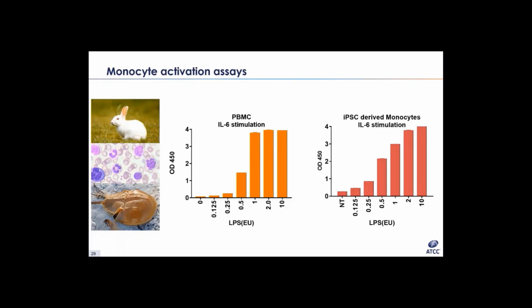Then there's the limulus amoebocyte lysate, or LAL, method, which requires the blood of the horseshoe crab. Either a gel clot is then detected, or more commonly now, a change in color or turbidity is measured. Unlike the rabbit pyrogen test, the LAL assay is limited by being unable to detect non-endotoxin pyrogens. Also, since thousands of horseshoe crabs are bled for this per year, with probably about a 25% mortality rate, the horseshoe crabs would probably prefer to be left out of this.